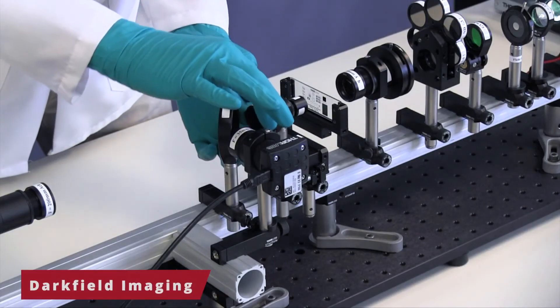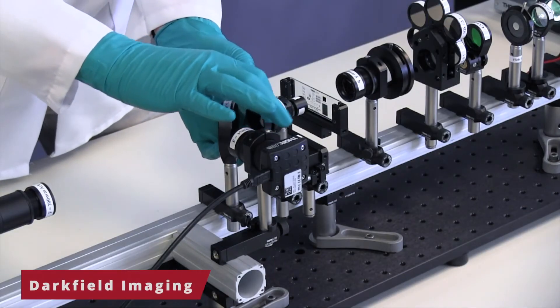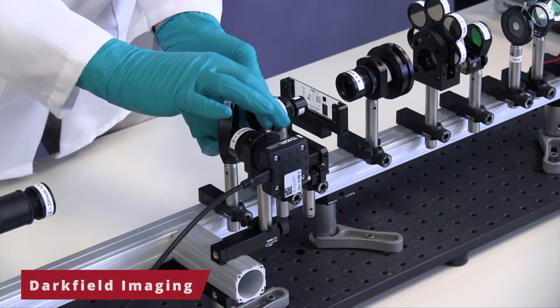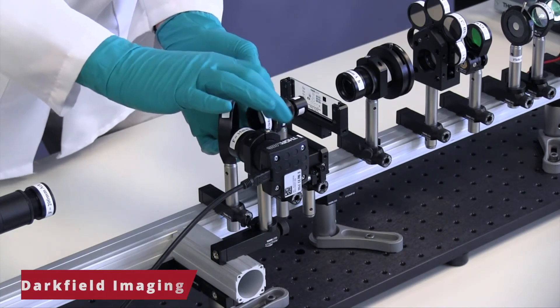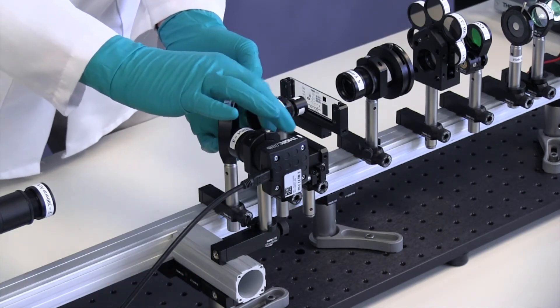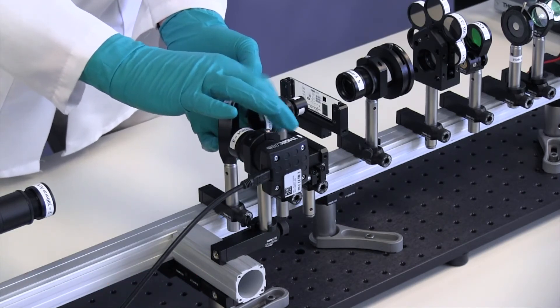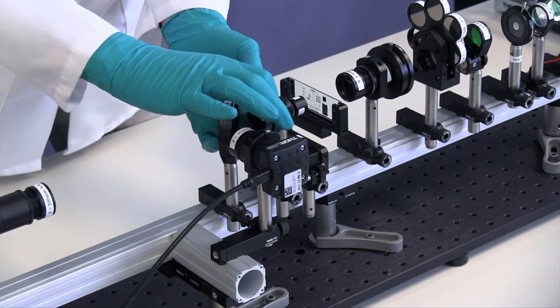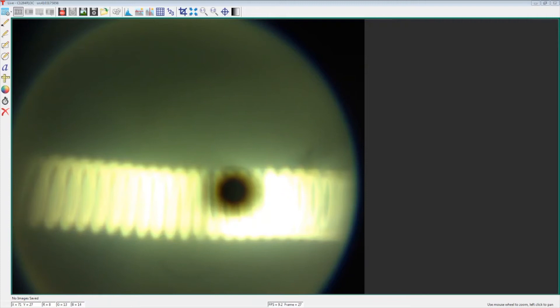To achieve a dark field image, make sure the aperture iris is open and take the zero order mask and attach it to the objective. A dot will appear in the color camera image. This dot will always be slightly out of focus.